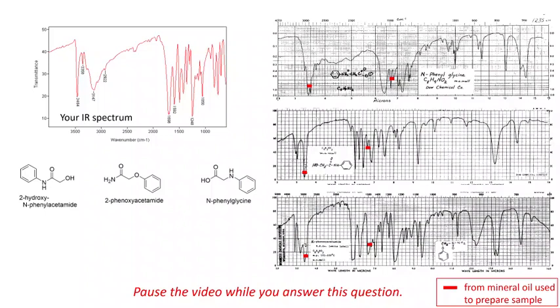They don't count. In addition, I want to point out that the scales on here are quite different, and spectrometers have different scales. If you look at the top of the first scale, you can see it's kind of like a log scale, and even the scale below it isn't exactly even. It gets closer and closer and closer as you get to the right.